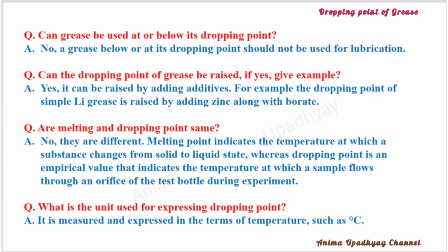What is the unit used for expressing dropping point? Since the dropping point is measured in terms of temperature, therefore its unit is degrees centigrade, that is the unit of temperature.